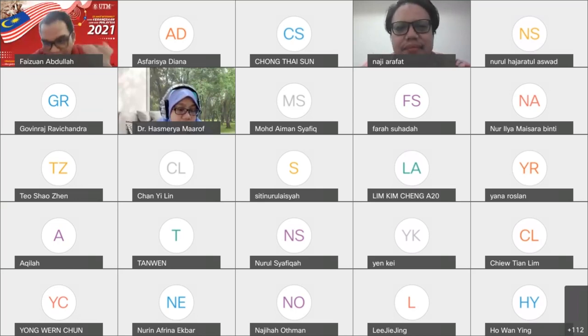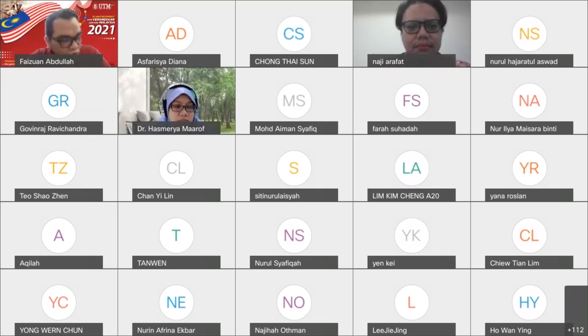Originally in the sample, it is precipitated by another compound and substance in the water, for example from the ambient environment, from the rainwater or from the river water. A lot of things are inside the water, so the metal will precipitate or attach with some other things. We need to use the nitric acid, a strong oxidizing agent, to make sure all the metals are freely available in the solution in the form of ion.